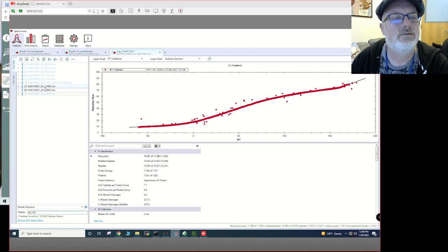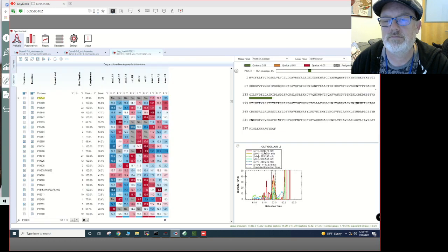It should be here, but why is it not in there when it was before? Let's go look. Okay, and there it is. It is there. Did I just mess this up by clicking on it? I probably did. Let's see.